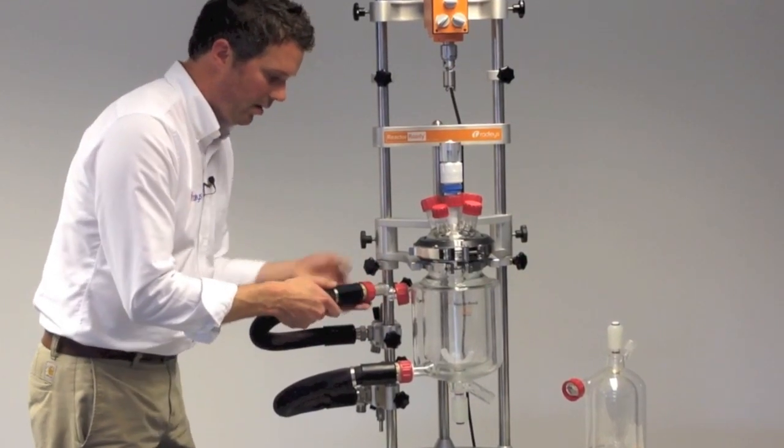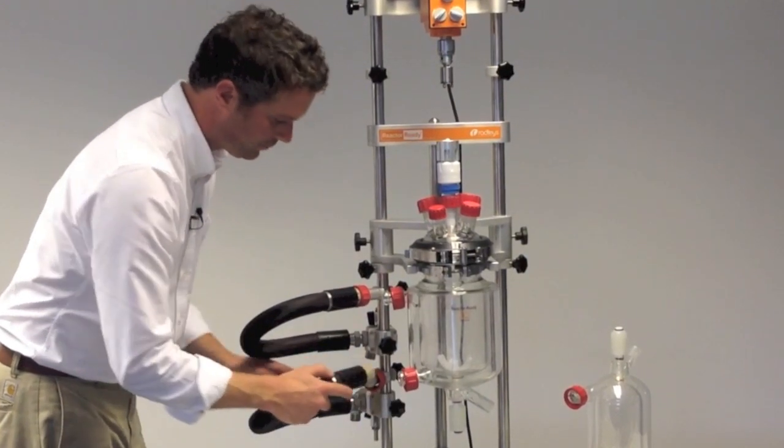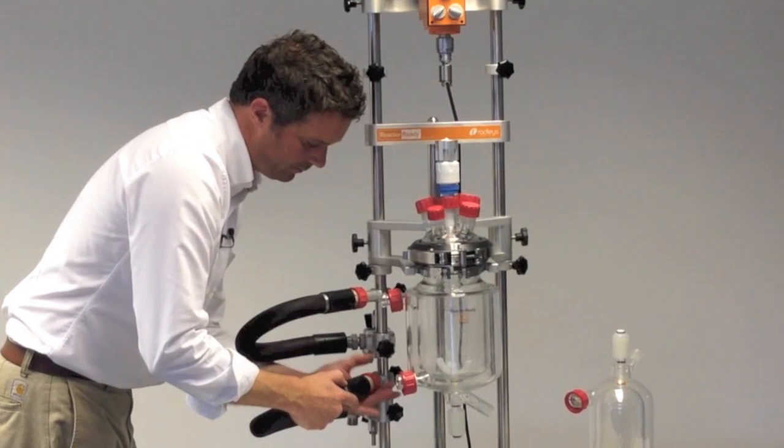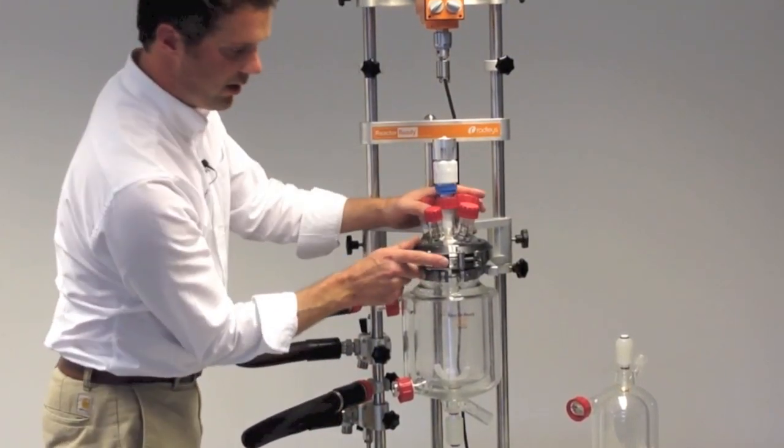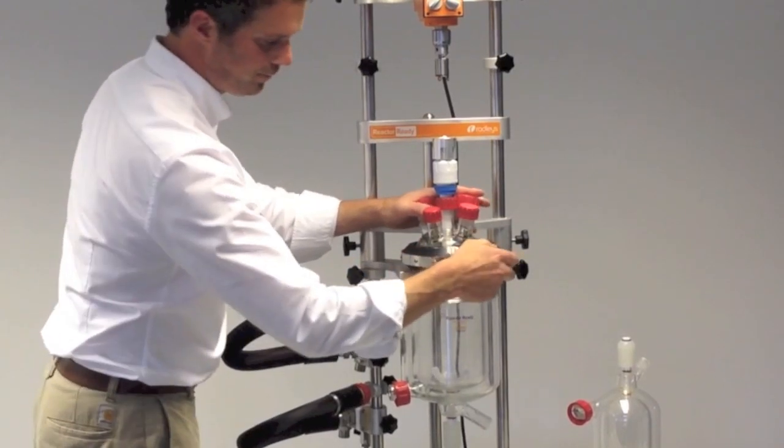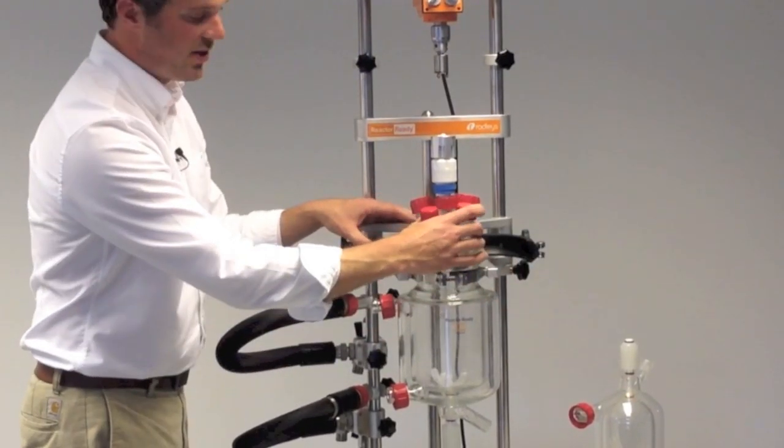I'll just pop this onto the hose tidy. It just keeps hoses out of the way whilst you're changing vessels. Then we're free to take the lid off and undo the quick release pad. All of the vessels share the same lid.